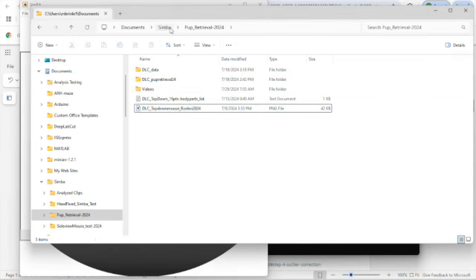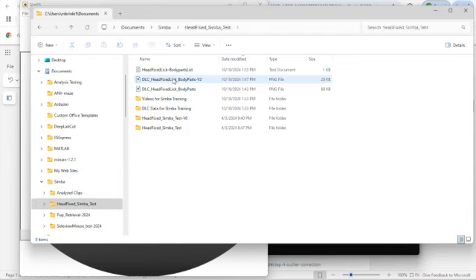So that, and then the other things that I did to prep: I created this body parts list, I created this figure just from one of my videos, and then I created two folders, one that is DeepLabCut data, and then one that is videos.